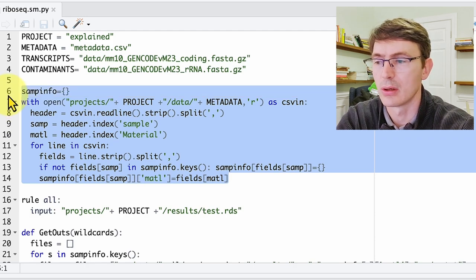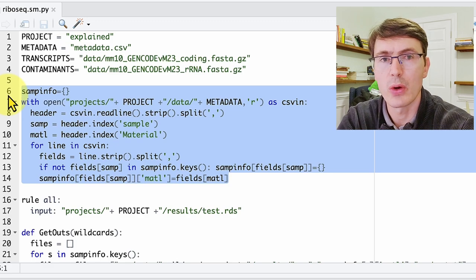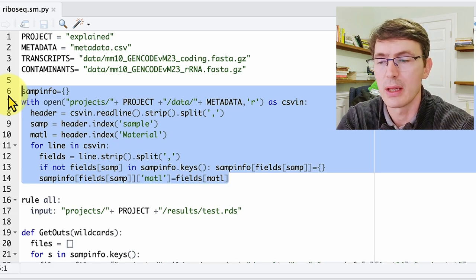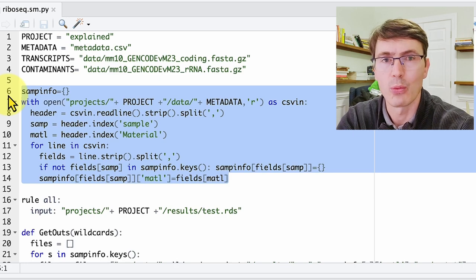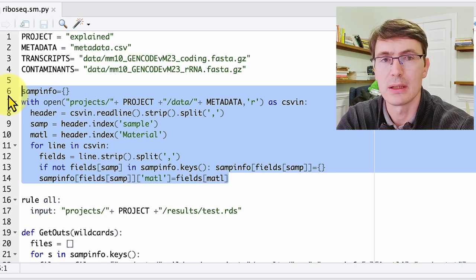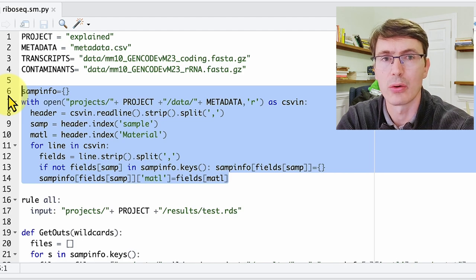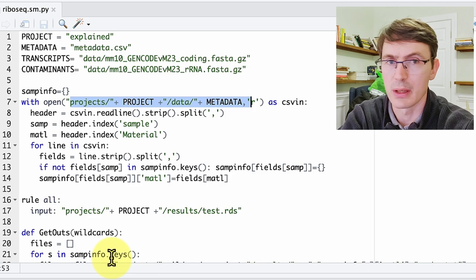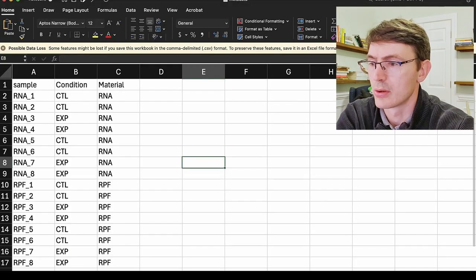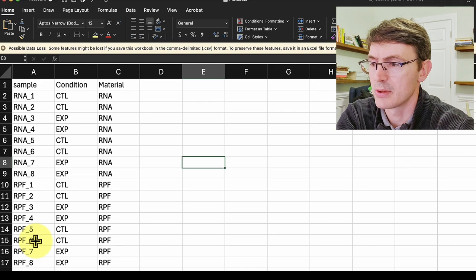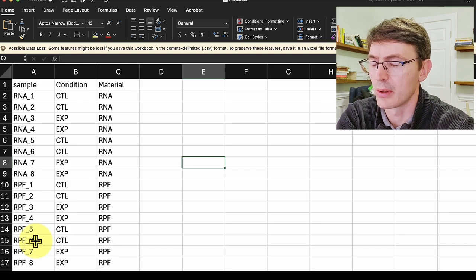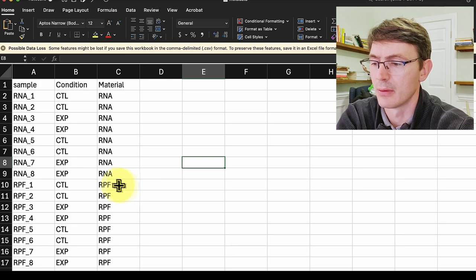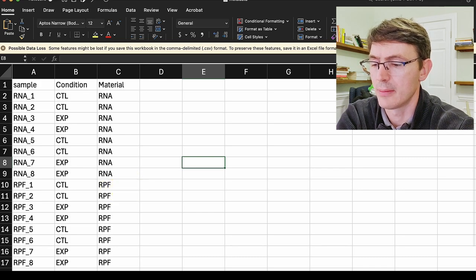Okay, that's just defining some parameters. And then we have this chunk here that is critical to understand what is going on in the rest of the code. Here, essentially what we are doing is defining a dictionary where we load for every sample the sample name and what type of library it is, whether it is like the total RNA or the ribosomal bound. We do that by loading the metadata that we defined previously. So this is the metadata table where we have the sample names, we have the different conditions, and we have the type of material, whether it is total RNA or this ribosomal-bound fraction that we are calling RFP here.